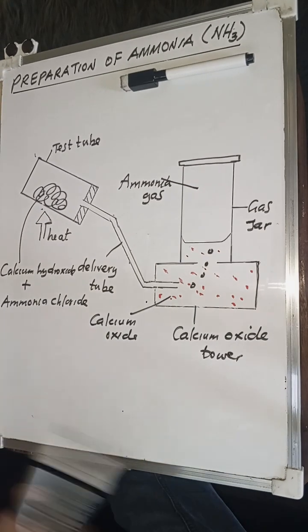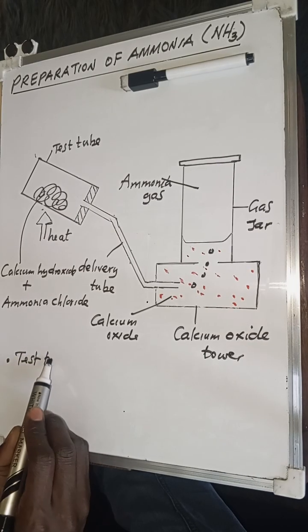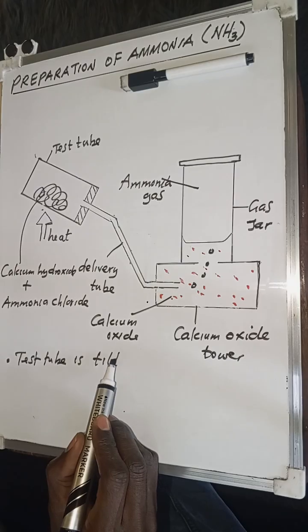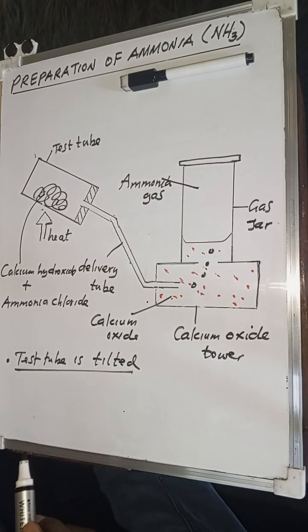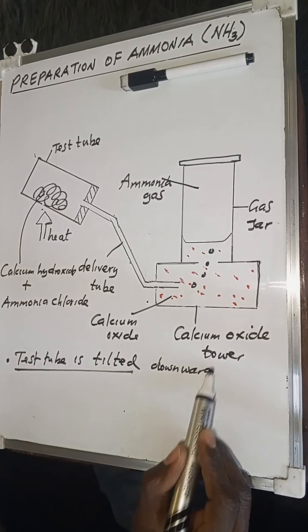At the same time, a few things that you need to remember is that the test tube is tilted. So the test tube is actually tilted. Now what is the reason why the test tube is tilted? Tilted slightly downwards, as you can see there. But the reason is very simple.